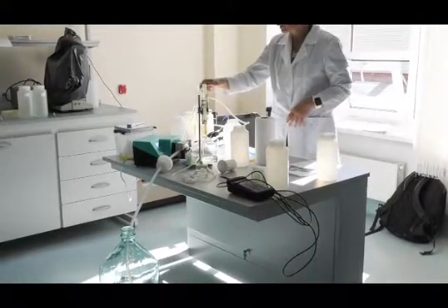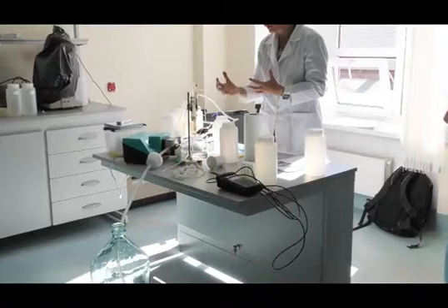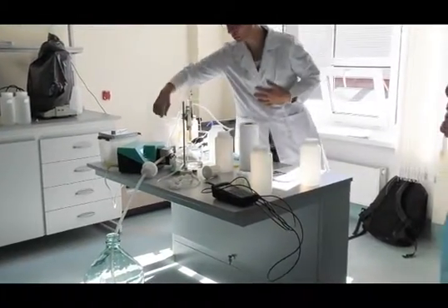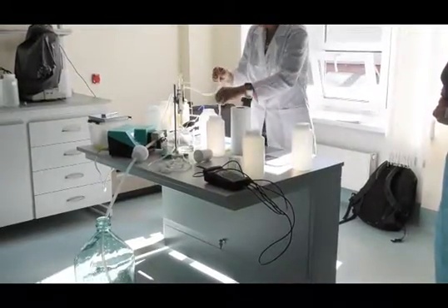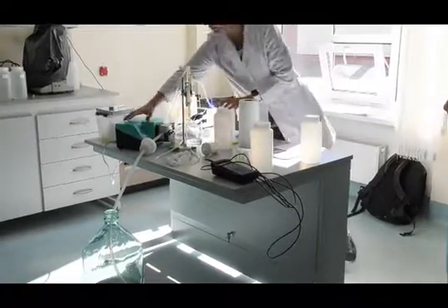Now it's connected, but nothing is going out of the filter, because for that we need to change the pressure. So the sample will now just go through this filter and through the tubes, and then we can collect the 0.45 fraction.